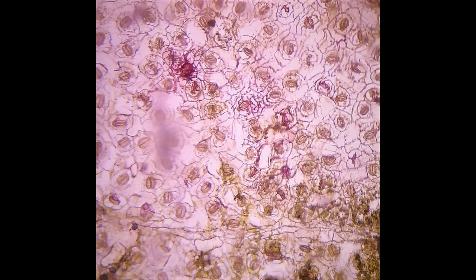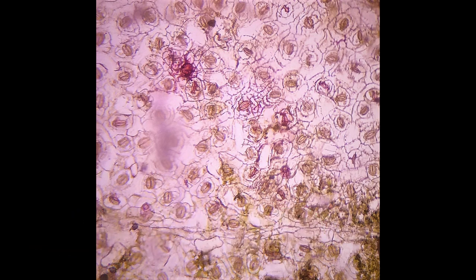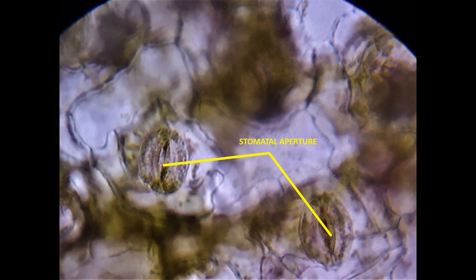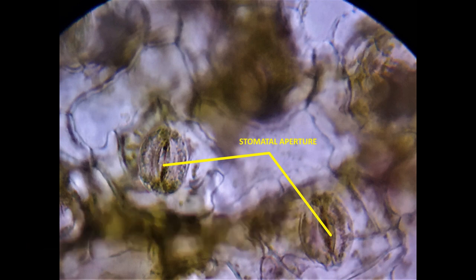Under 10x magnification, the epidermal cells are visible which are irregular in outline and have no intercellular spaces. Many small pores are seen scattered among the epidermal cells, and each pore is guarded by two bean-shaped guard cells, each containing chloroplasts and a nucleus.